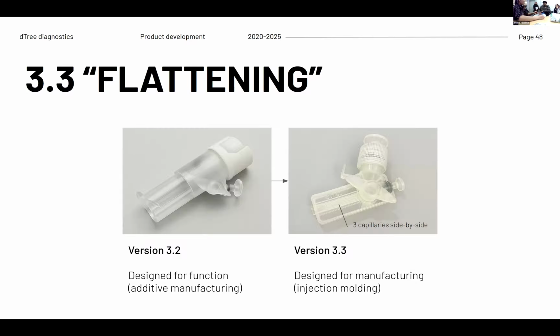Now if I tap, I want to make sure that I fill exactly that and all the way through. So I make this an access chamber. It has to at least go through that and fill the entire cavity. Otherwise, without that, it's hard to fill all the way because of air pockets. This just makes it easier to exchange air and liquid so that it can fill up entirely.